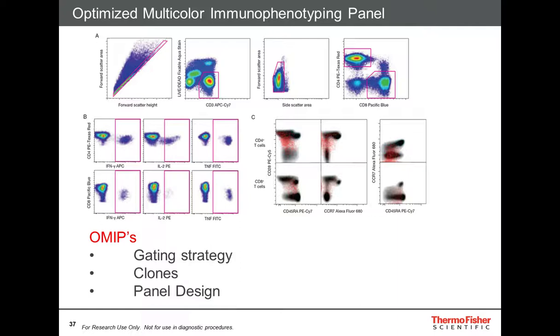Did I have any difficulty with certain antibody combinations? Here you can see in the gating strategy, I don't use a forward and side scatter gate to determine any of my cells of interest. I just use it as a debris elimination gate.